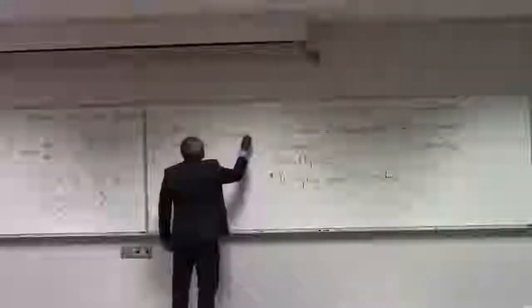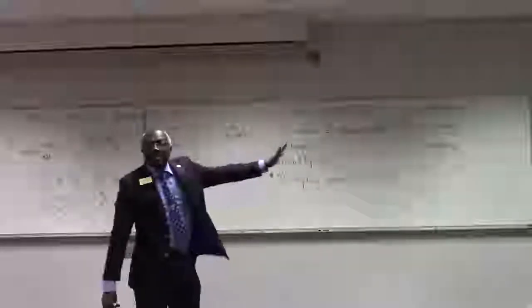If I had an H attached to carbon attached to fluorine, that shows up at about 4.5-ish or so. But clearly then the impact of two chlorines beats the impact of one fluorine. And then if it was bromine, the number drops to about 3.0. So H attached to C attached to bromine, that's only about 3.0. So you can see the impact of electronegativity, you can see the impact of the number of those groups, and so on. So that's induction.